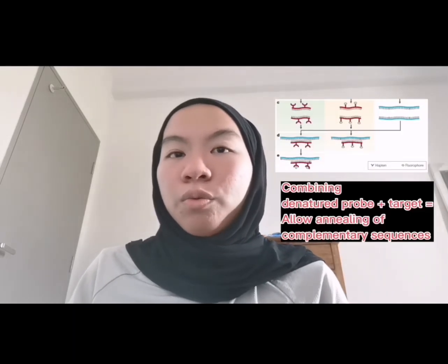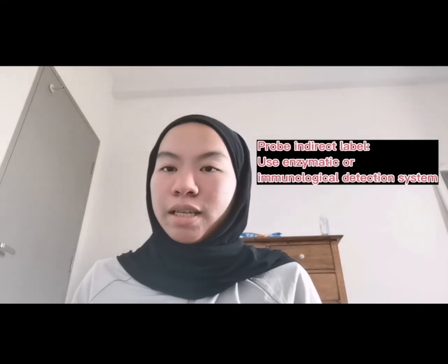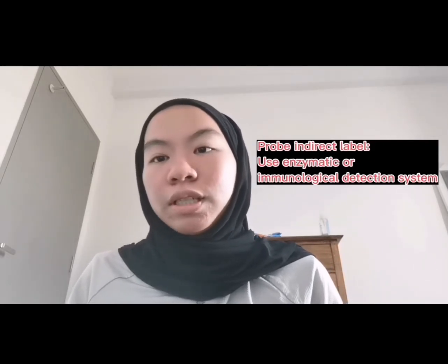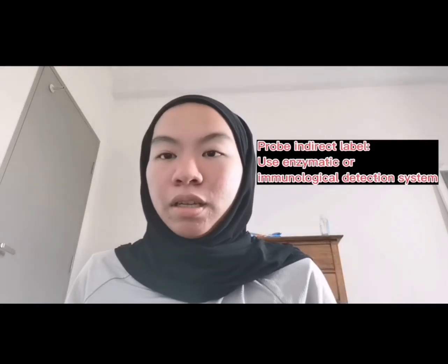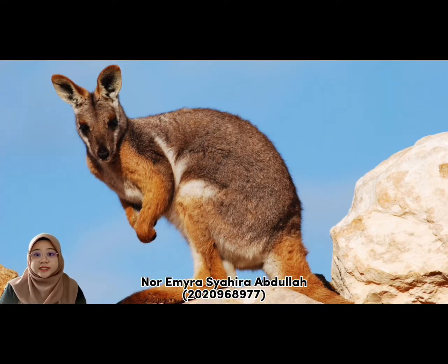So the labeled probe and the target DNA are denatured, and then combining the denatured probe and target will allow the annealing of complementary DNA sequences. If the probe has been labeled indirectly, an extra step is required for visualization of the non-fluorescent hapten that uses an enzymatic or immunological detection system. Next, we move on to the case study.